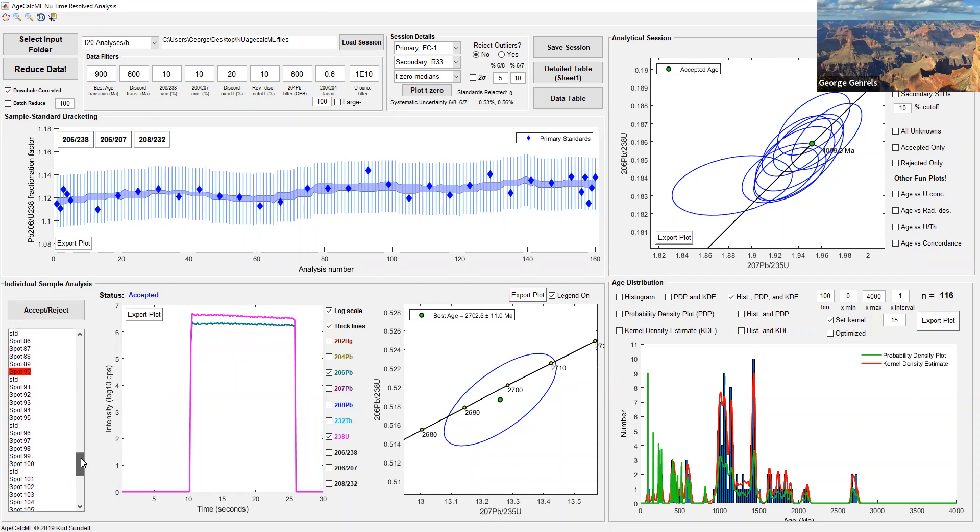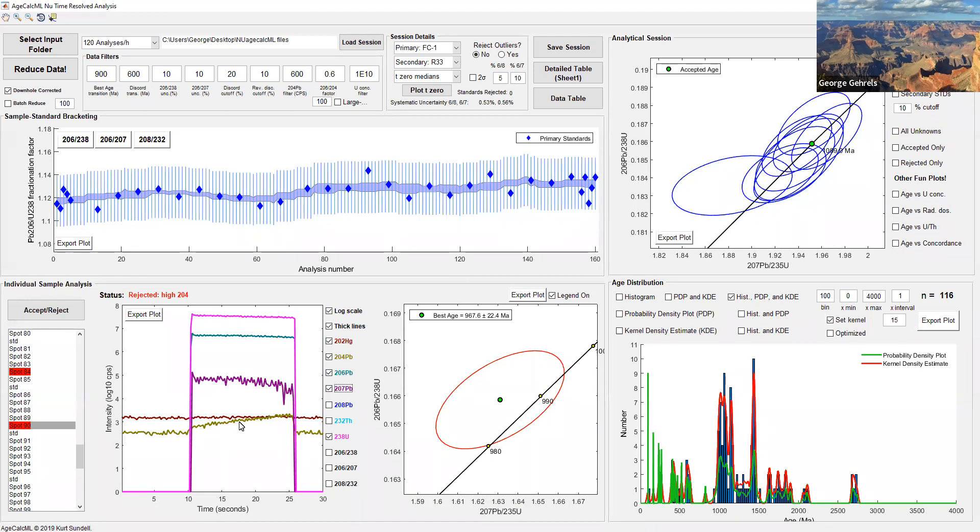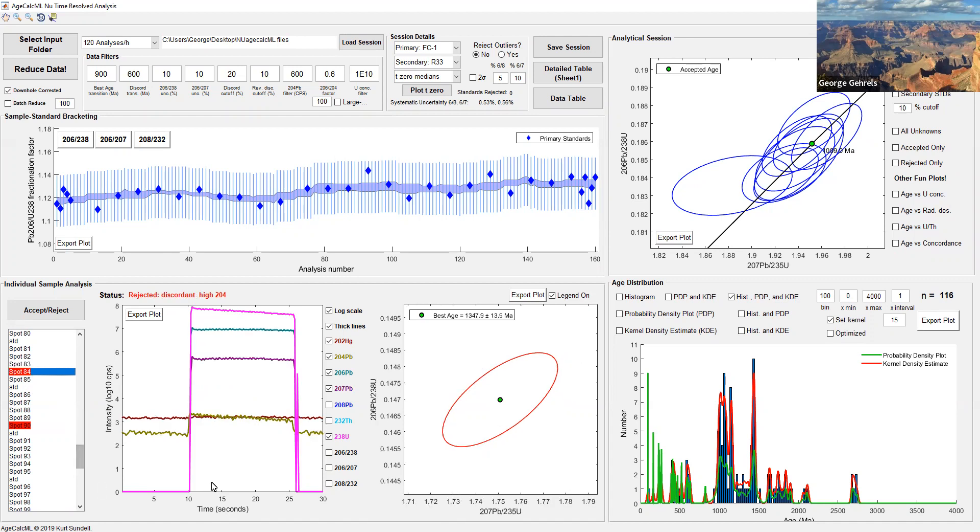You can go through and find some that look good and some that look not so good. In red, we have the software set up such that if there's something funky about the analysis, it'll turn it red. Let's take a look at this. 238 looks pretty good, 206 looks good, 207 looks good, but look at 204. You fire the laser and the 204 content goes up. That means there's a fair amount of 204. In this case, it must be lead because mercury stays constant. Now we have a really large initial lead correction and we don't want to use this analysis, so it shows up here rejected for high 204. You can go through and look at all the red ones and decide if they really should be rejected or not.